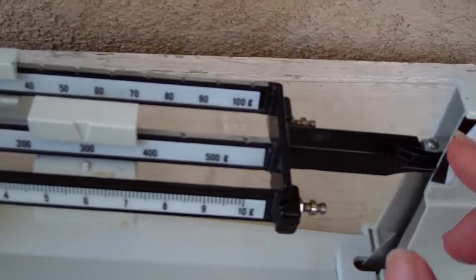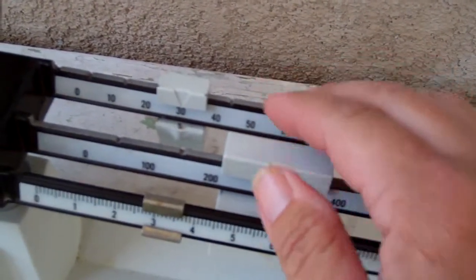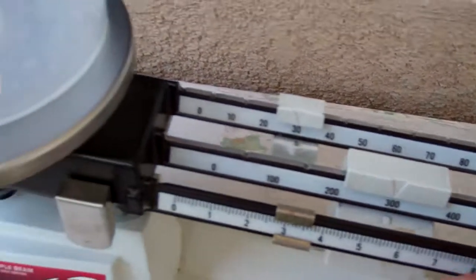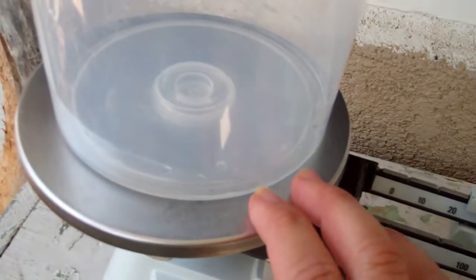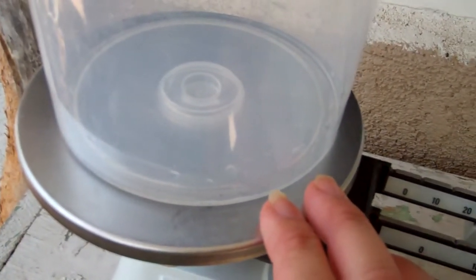Zero line, beams, with the riders. Knowing how to read them is important, otherwise your number is meaningless. And knowing exactly what's on the pan. Good luck, bring your questions to class.